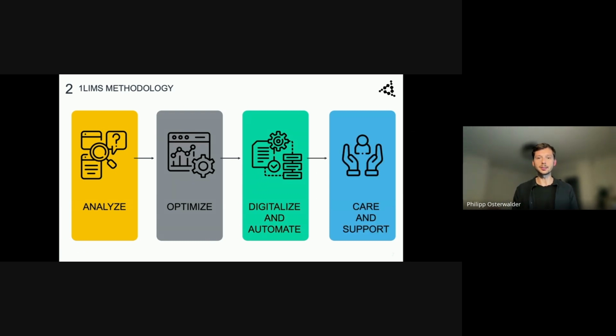And last but not least, there is kind of a never-ending story. We keep supporting and guiding customers with best practices, with tools, with updates, with new tools to help them to have and create a better job in their laboratory, which is faster, safer, and brings more efficiency to the team and at the end to the company itself.